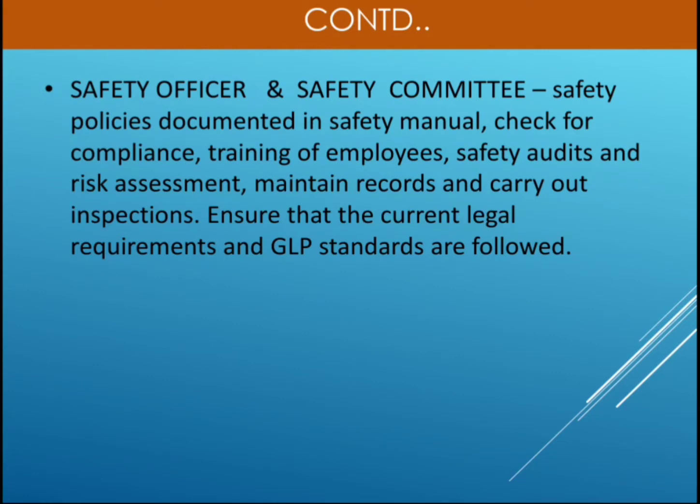Safety officer and safety committee. Safety policies are documented in the safety manual. You should check for the compliance. Training of the employees. Check for the compliance means whether it is properly functioning or not. That should be taken into consideration. If we have only documented all the things on paper, but it is not being employed by the employees, that is not the thing which is to be implemented. Training should be there for the employees.